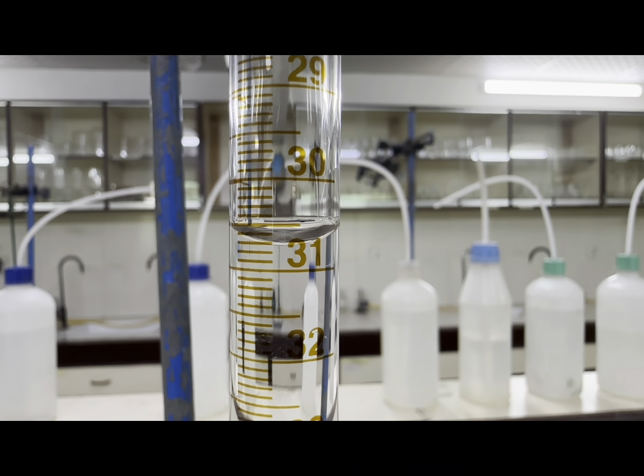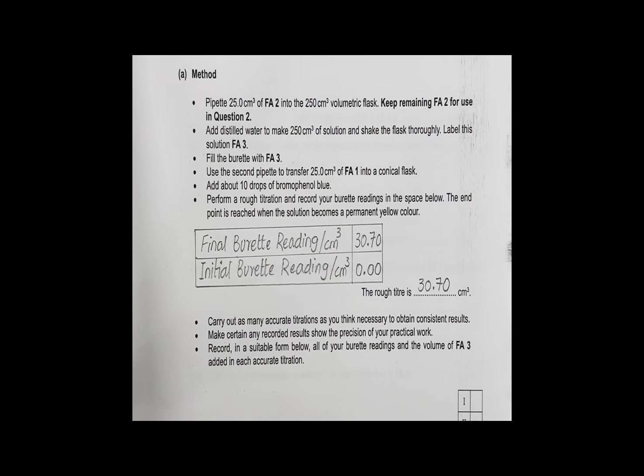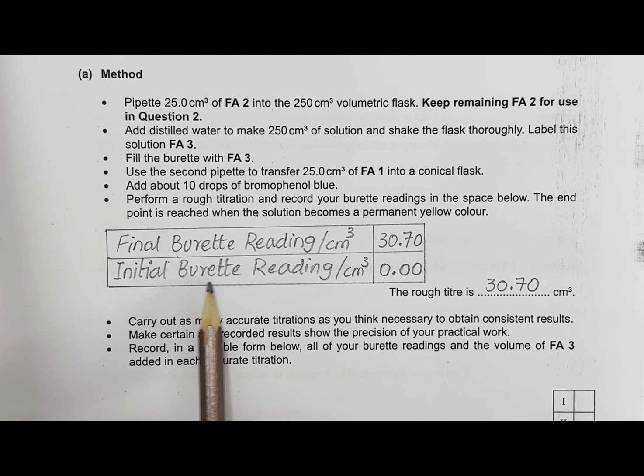So this is the final burette reading, 30.70. I have recorded the initial burette reading as 0.00 centimeter cube because every burette reading has to be 2 dp. Final burette reading as 30.70, so the rough titer used is 30.70 centimeter cube.